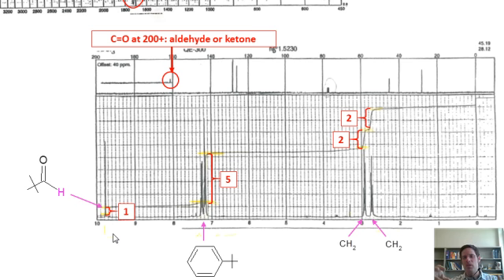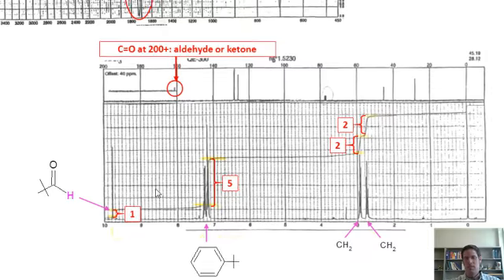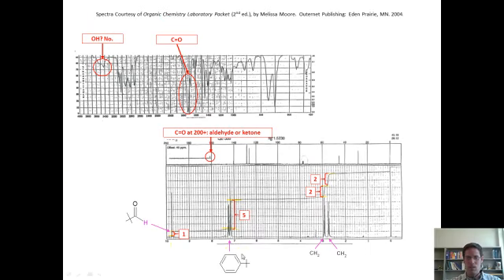How in the world can I put those together? In other words, I'm at step 4. How in the world can I play Legos and put my pieces together? Well, first of all, I take my benzene ring, and if I look at the pieces I've got left, a CH2, another CH2, and an aldehyde, there's only one way I can consider putting those together. I have to have my one CH2, then my other CH2, then my aldehyde. Now that I've got my guess, I step back and look and ask myself, is this guess consistent with all the data that I have?